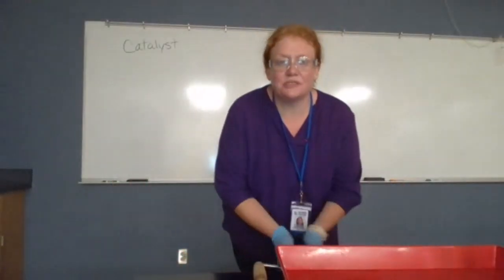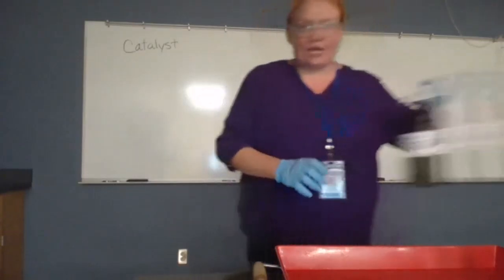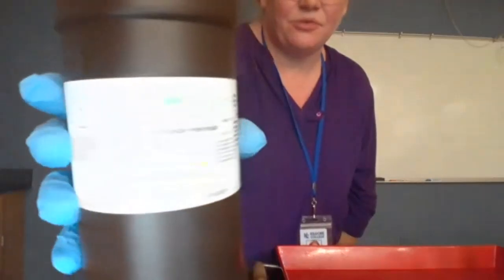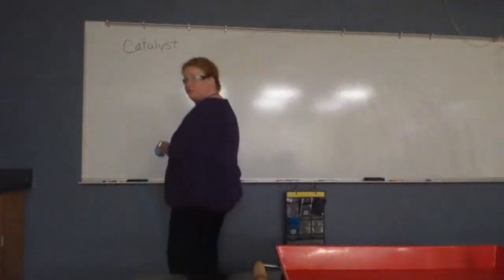Hi everyone, I'm going to do a demonstration of a type of reaction that you learn about in chemistry. It is based on a single reactant. We are going to use this reactant, hydrogen peroxide. The formula for hydrogen peroxide is H2O2.